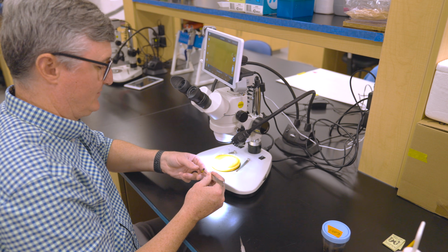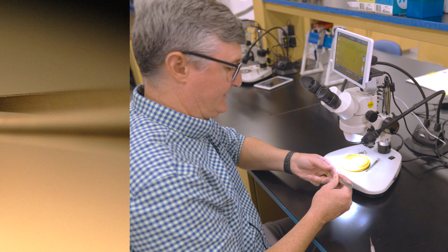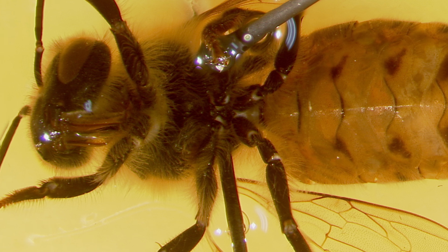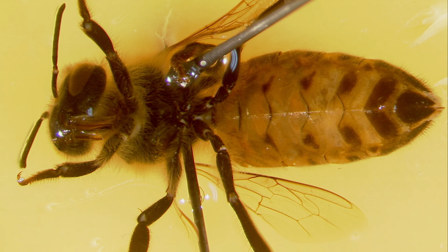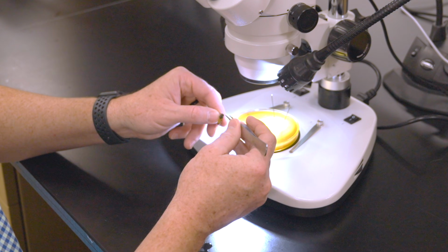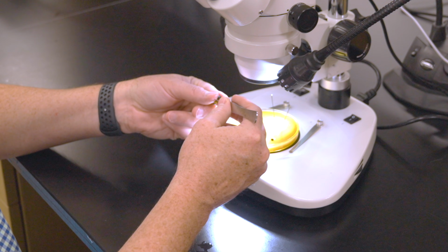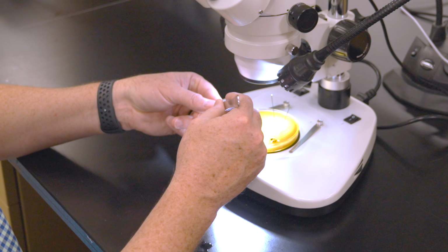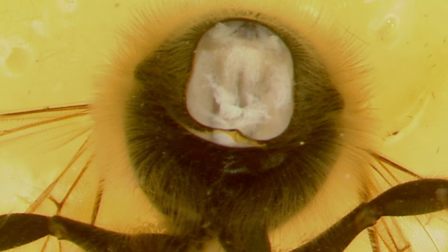I grab an adult bee with 1 pair of forceps, and then with my hands I will position that bee such that I am holding that bee's wings with its belly facing towards me. And with the bee in that position, I use the 2nd pair of forceps to remove the bee's head and the bee's abdomen. You remove the head because it's that end of the thorax that has that robust tracheal system. So you need to remove the head so that you can get right down to the thorax.